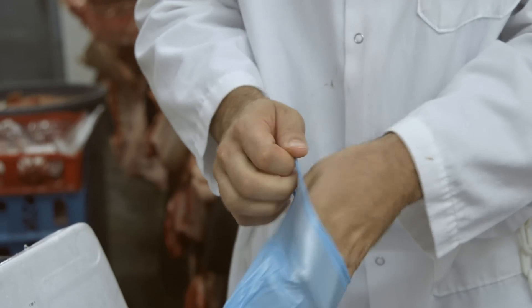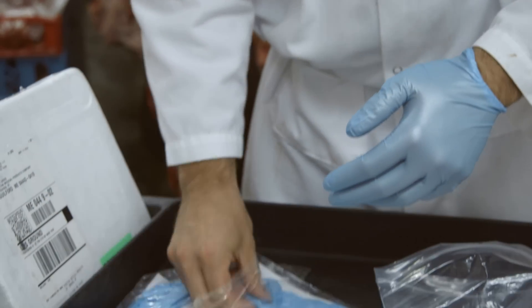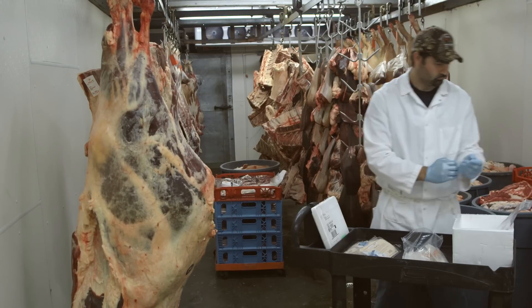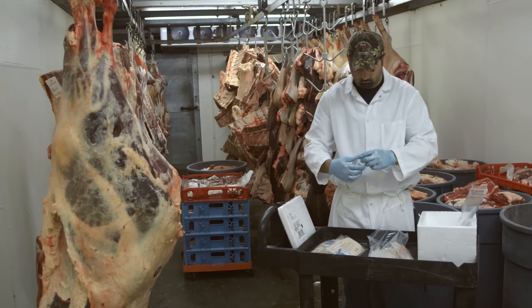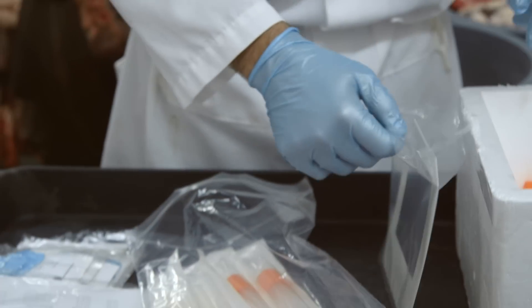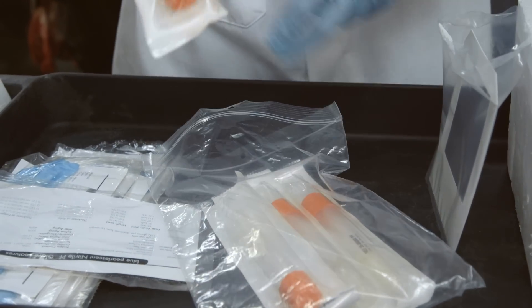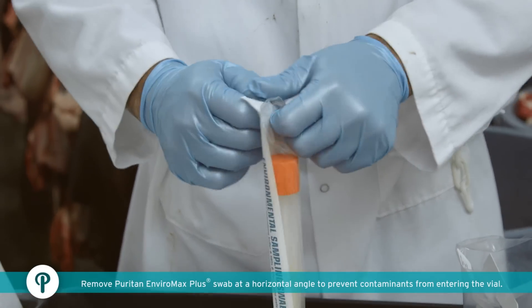Put latex gloves on hands. Open the bag containing the sterile 10 cm x 10 cm sampling template and place the opened bag onto a clean surface until ready for use. Open and remove Puritan Enviromax Plus collection kit from its package and place on clean surface until ready for use.